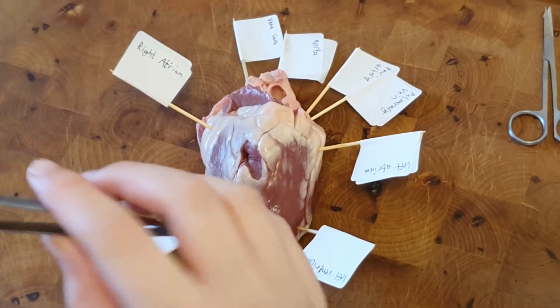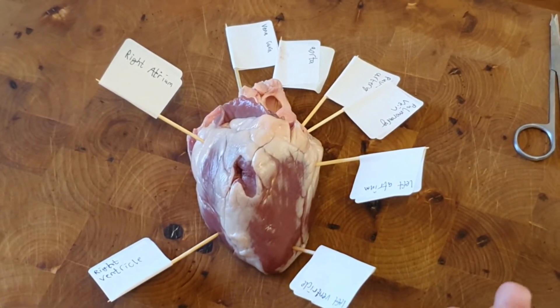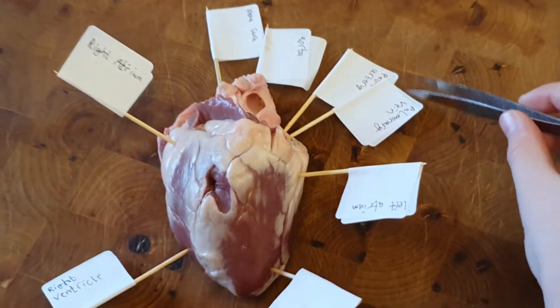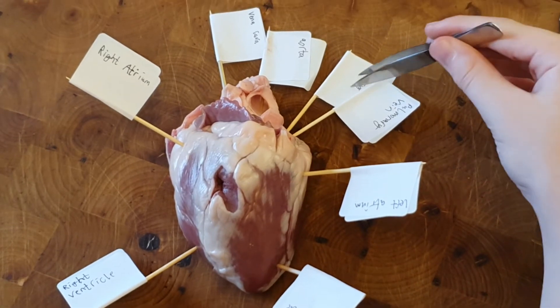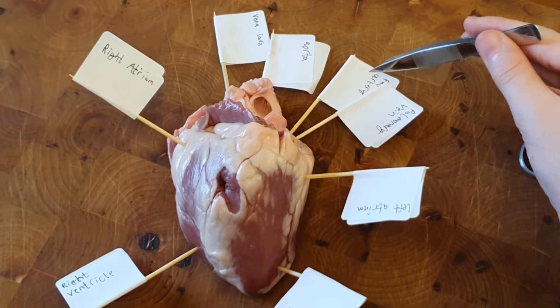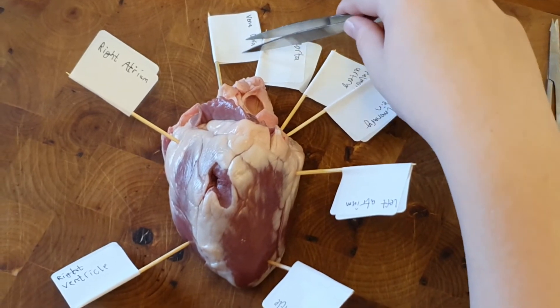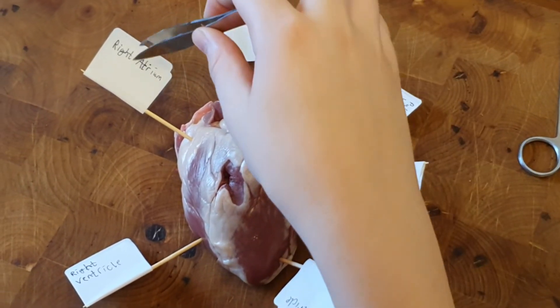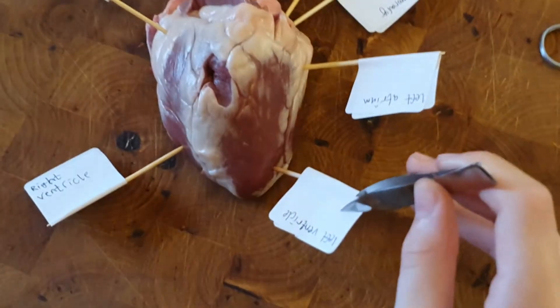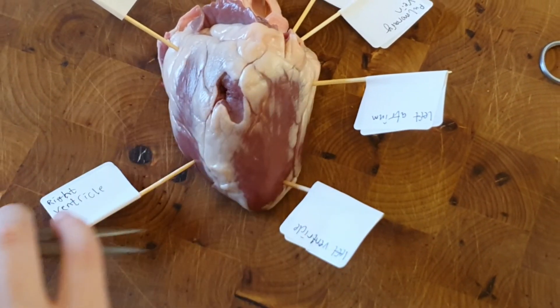We've now closed the heart. There were certain labels we couldn't put on because of the positioning of certain veins and arteries, so with these two we've been able to put them on the outside. These are the pulmonary vein and the pulmonary artery. We also have the aorta and the vena cava at the top, the right atrium, the left atrium, the left ventricle, and the right ventricle towards the bottom.